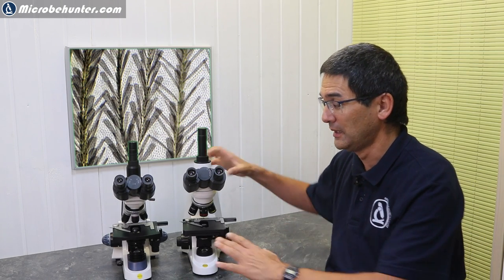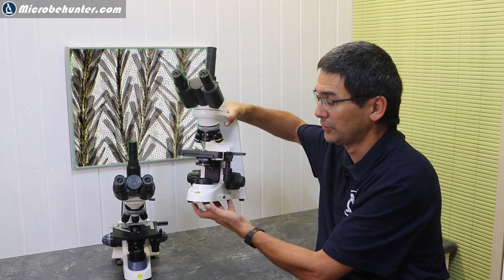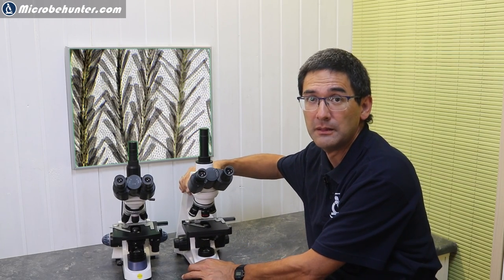Now there are a few additional similarities. One important thing is that if you lift it up here, if you look here on the bottom, the microscope has a triangularly shaped base. Many microscopes are actually rectangular. These two here are triangular and this gives it quite a bit of stability. It also makes it a little bit more narrow at the front and wider in the back. It does give a little bit more stability as well.